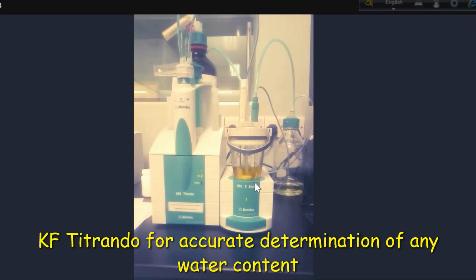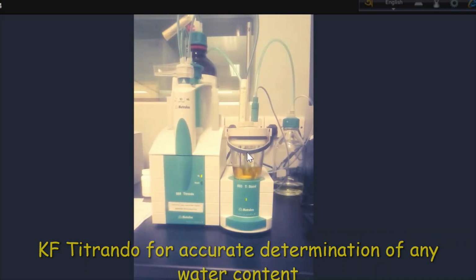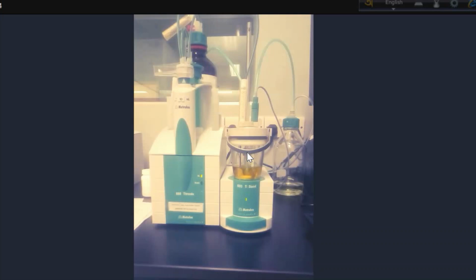However, it is important to note that the Karl Fischer method may not be suitable for samples that contain other substances that can interfere with the reaction, such as reducing agents or volatile solvents. And proper calibration and validation procedures should be followed to ensure accurate and reliable results.